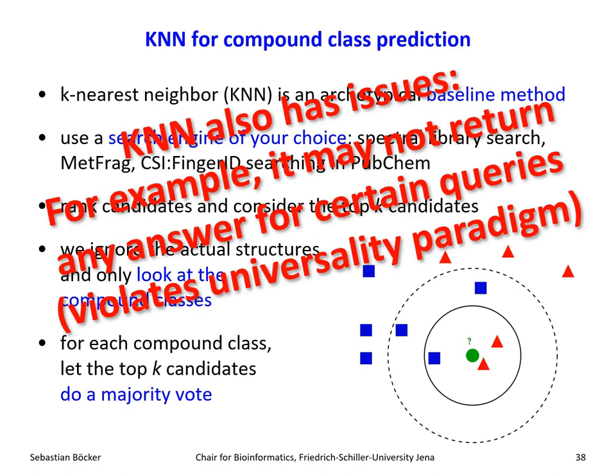And you might now play around with it a little bit and then say, oh, if there are no candidates, I'm also considering this and this and this molecular formula. But this is no longer scientific elegance. This is then also not very simple. There's a good chance that your method will then in the end work very well for the data that you're evaluating it on, but it will never work for any other data because you have done manual overfitting to the data. So KNN is known for these issues. They don't show up in any evaluation. In evaluations, KNN is usually very hard to beat.